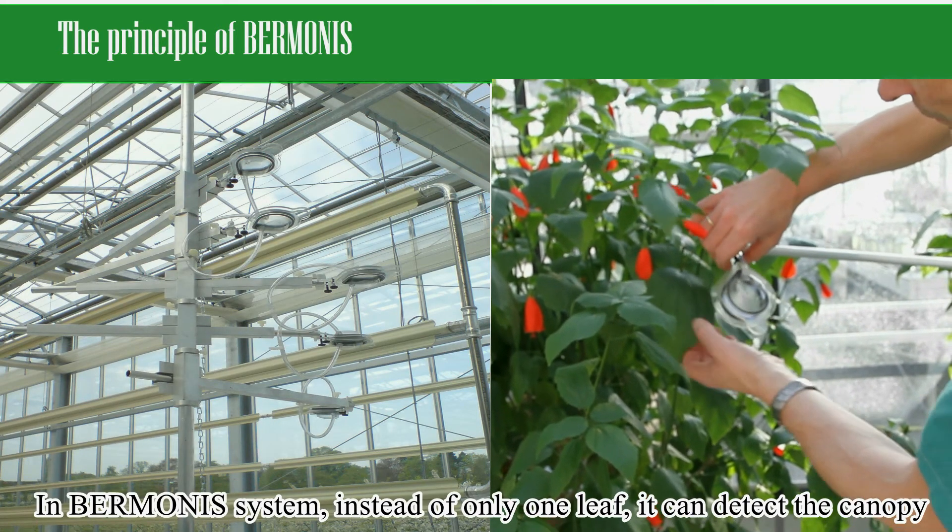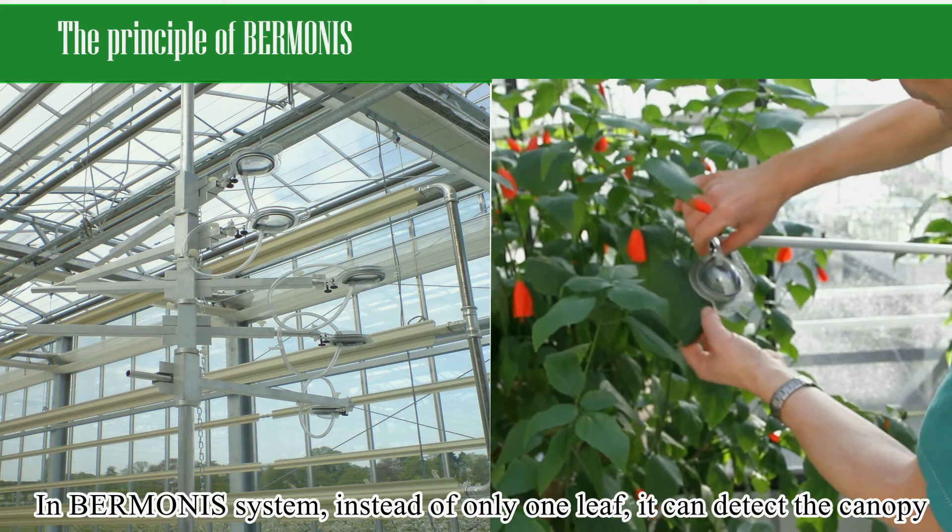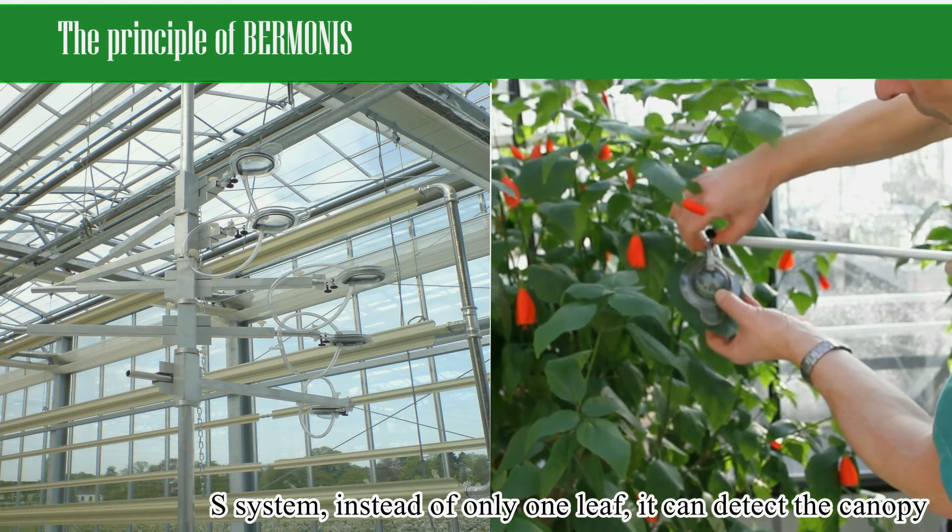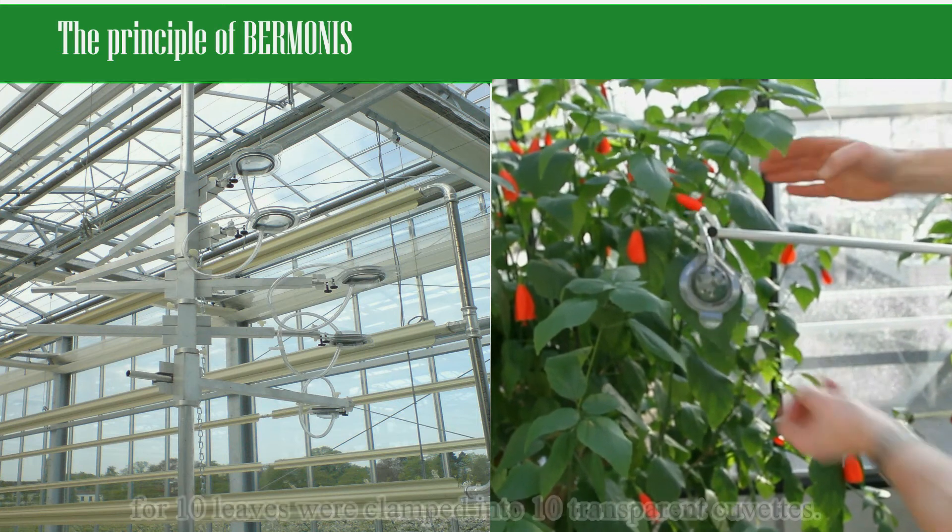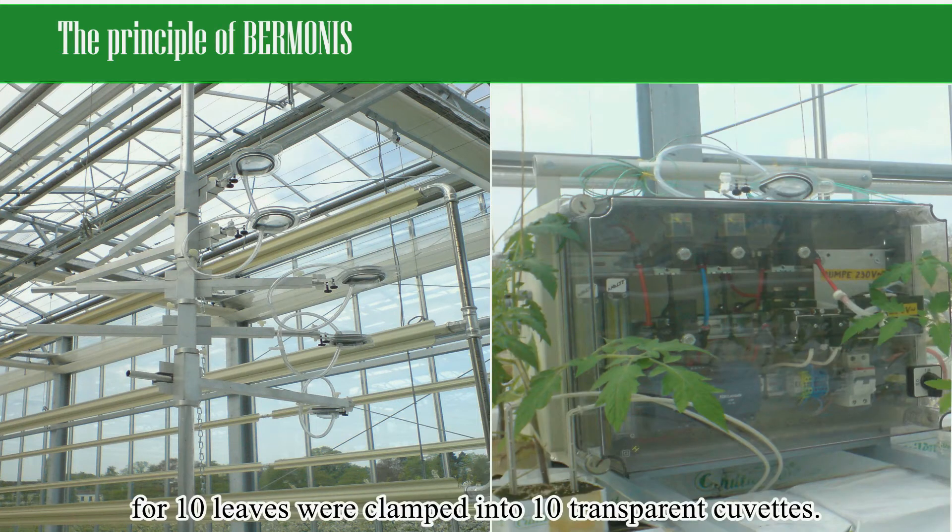In the BERMONIS system, instead of only one leaf, it can detect the canopy photosynthetic performance at the same time, for ten leaves were clamped into ten transparent cuvettes.